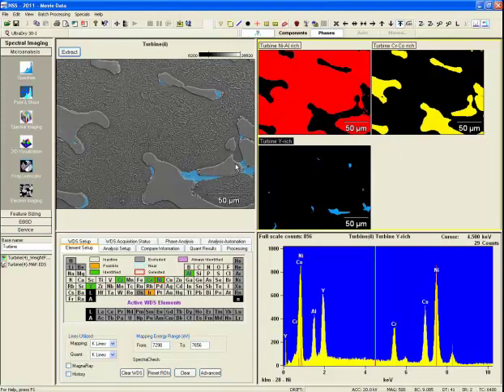So the COMPASS routine statistically analyzes the data set in a self-consistent manner. Everyone that pushes the button gets the same results, and it shows uniquely where all of these phases are across the whole sample.